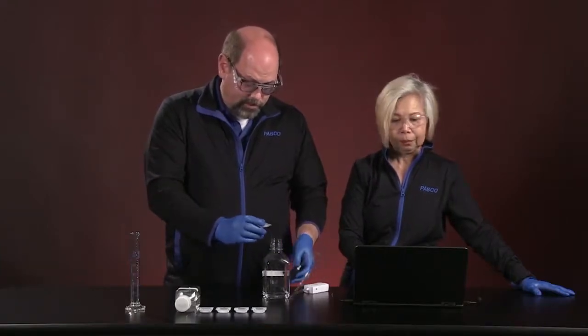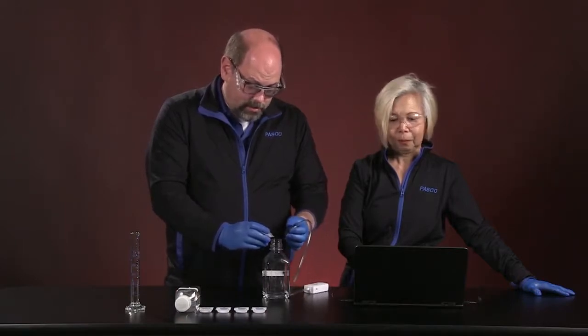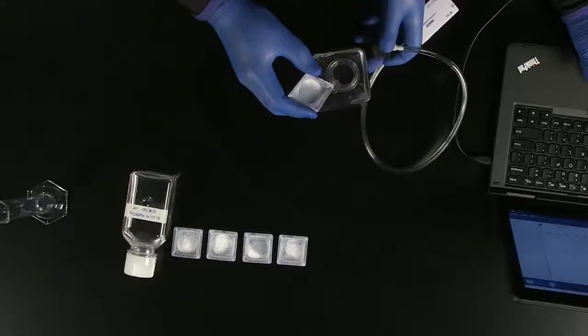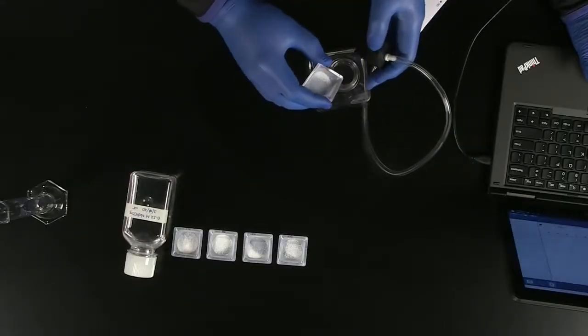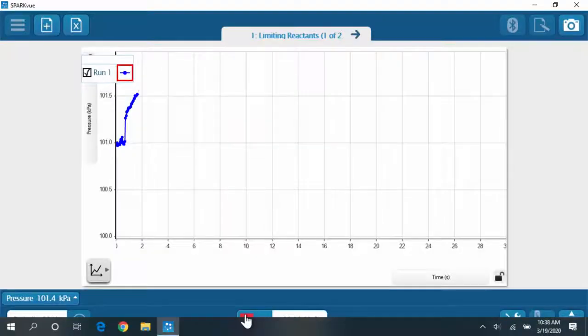Okay, here we go. I'm gonna cap it off as quickly as I can. I'm going to give it a little bit of a flick to get all this material into the sodium bicarbonate. One, two, three. There we go.